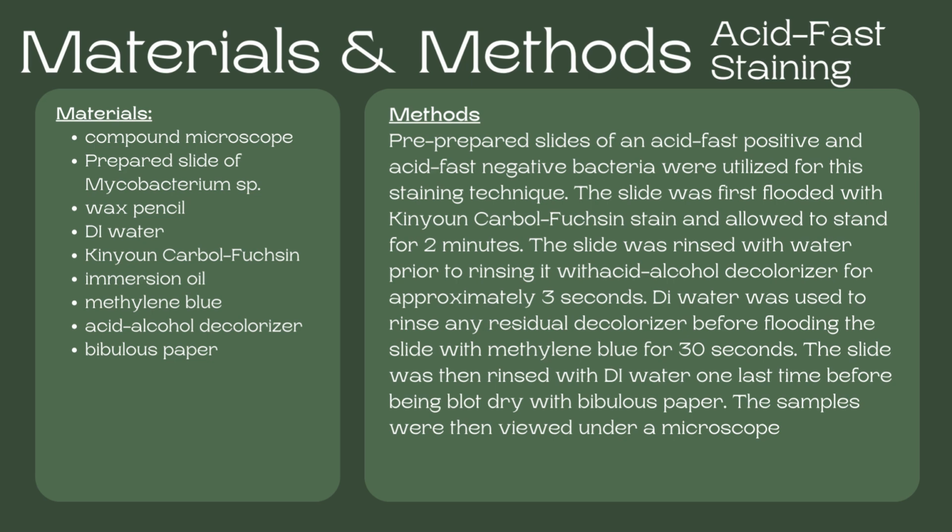The slide was first flooded with carbol fuchsin stain and allowed to stand for 2 minutes. The slide was rinsed with water prior to rinsing it with acid alcohol decolorizer for approximately 3 seconds. Deionized water was used to rinse any residual decolorizer before flooding the slide with methylene blue stain for 30 seconds. The slide was then rinsed with deionized water one last time before being blotted dry with bibulous paper. The samples were then viewed under a microscope.